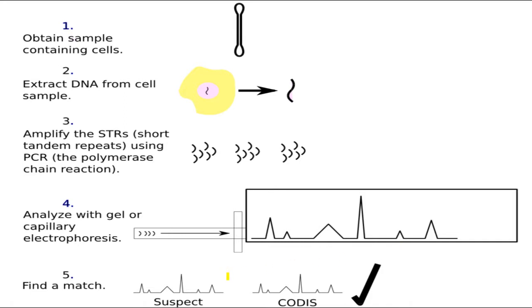So if you have a suspect, let's say at a crime scene, you picked up this DNA, and here's your DNA profile. You can check it with an actual person. Say, is the person who was at the crime scene the suspect? Or what we're seeing here is someone left their DNA at the crime scene. We check it with CODIS. CODIS is the Combined DNA Index System.